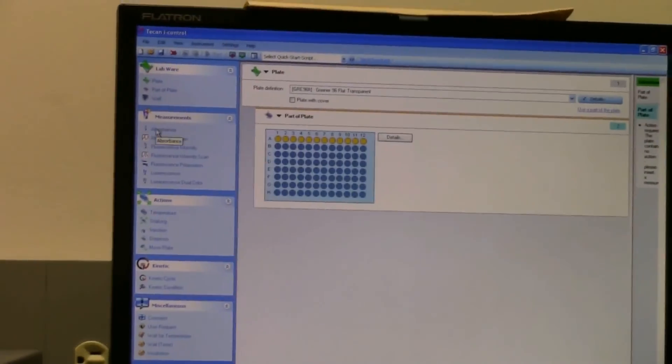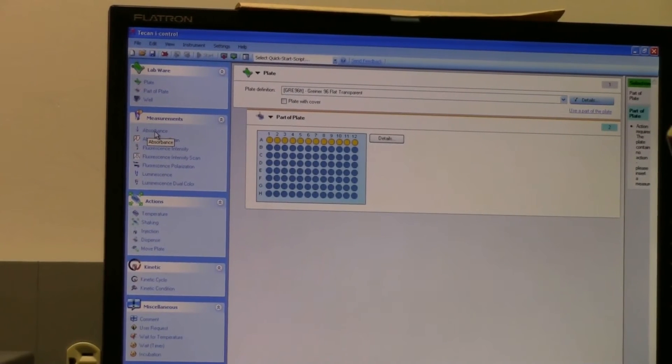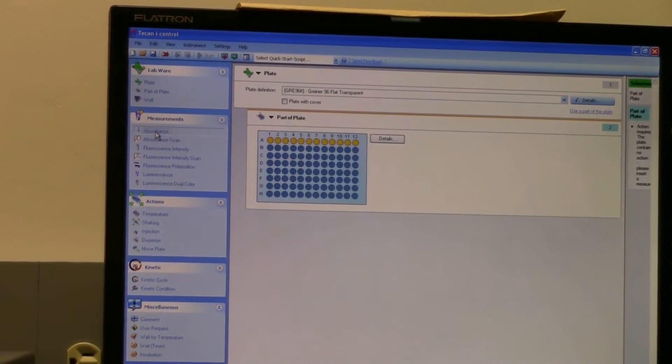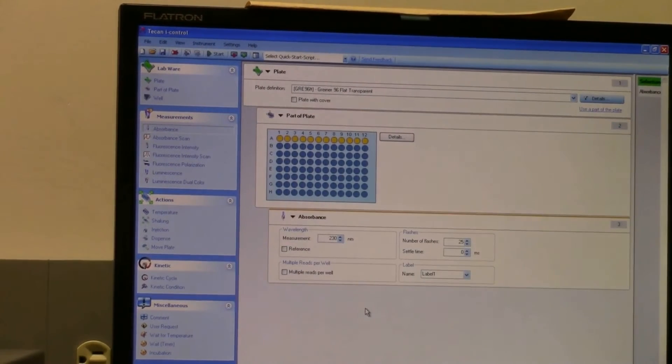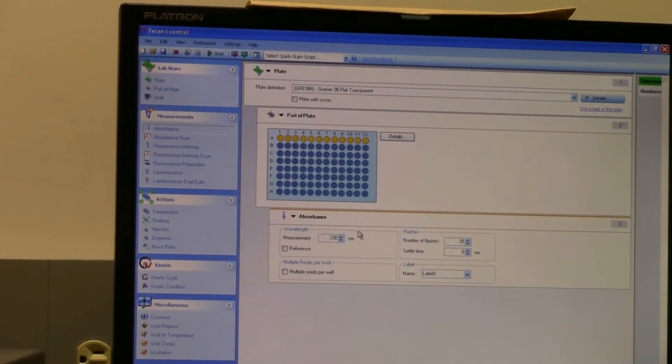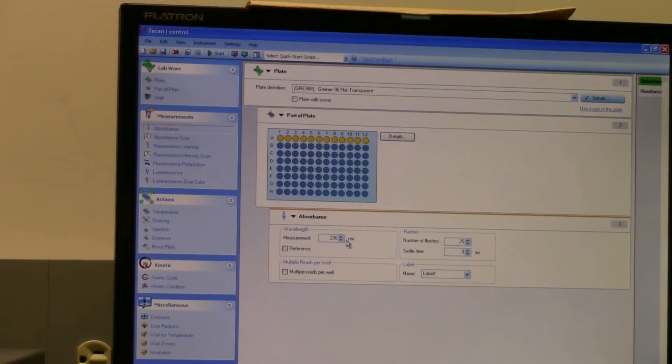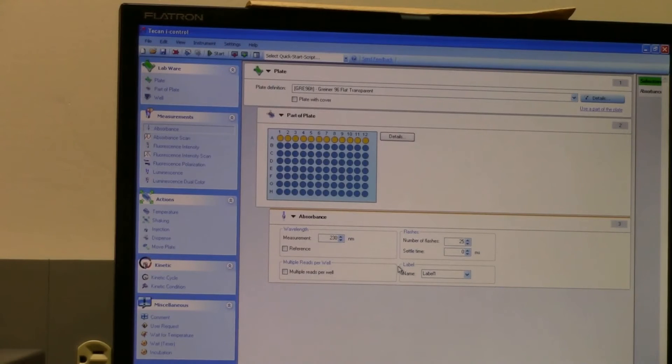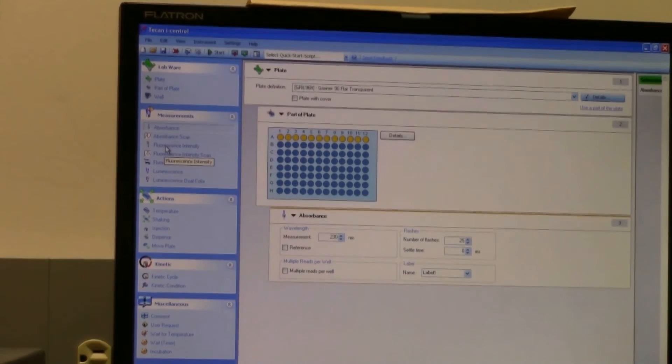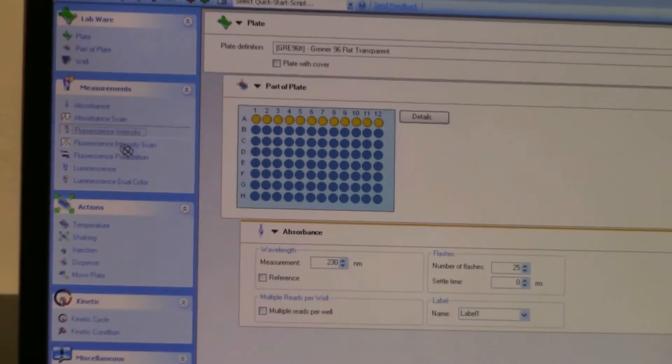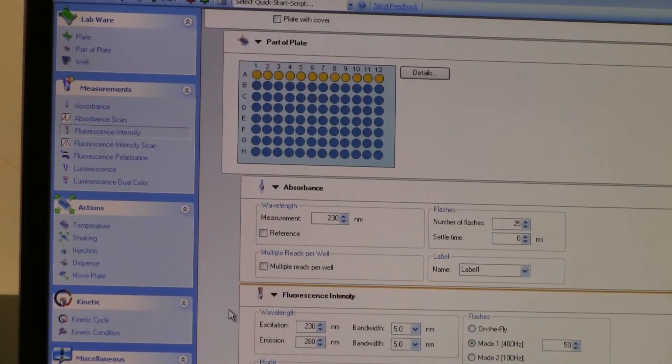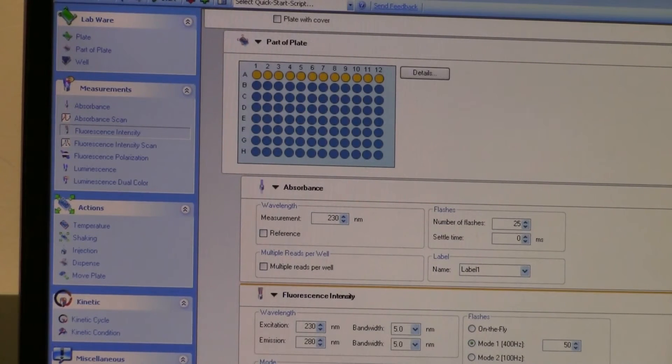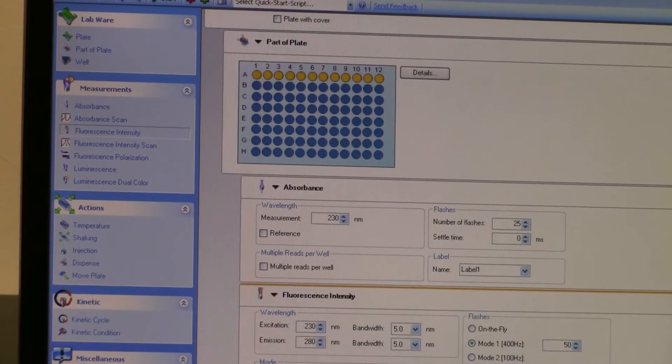So if you wanted to do an absorbance measurement, click this, drag it into here, and then you set up your parameters in here - the wavelength and whatever else information you need to know. If you're doing a fluorescence intensity scan, you take this one, you click it, drag it into this window here. Same thing, it just has all the different parameters that you need to fill in.